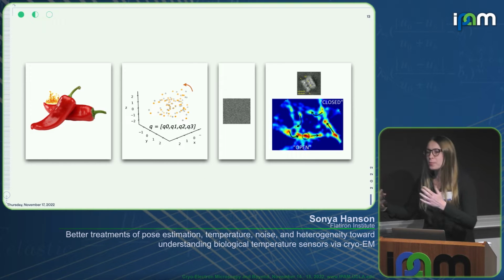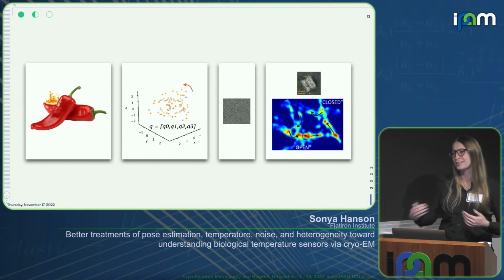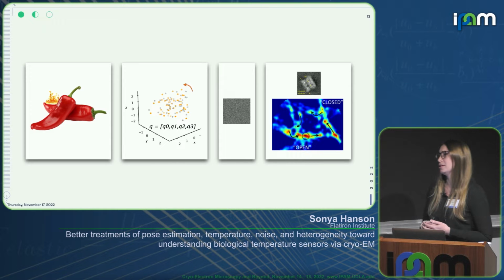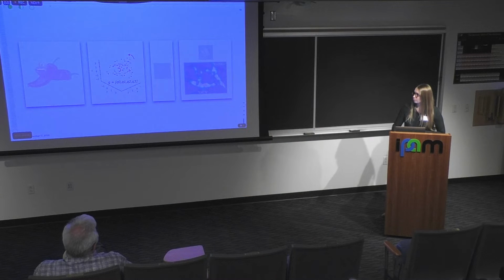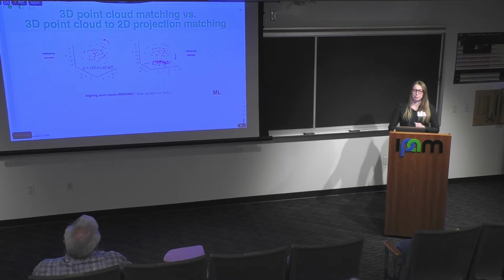So that, I hope, convinces you that understanding the heterogeneity of these proteins will help us understand their function. And now I'm going to go deep into some nitty-gritty details about quaternion pose estimation, which we heard earlier can be intrinsically linked to actually estimating conformational heterogeneity from Tristan's and Fred's talks yesterday. So yes, quaternion pose estimation.